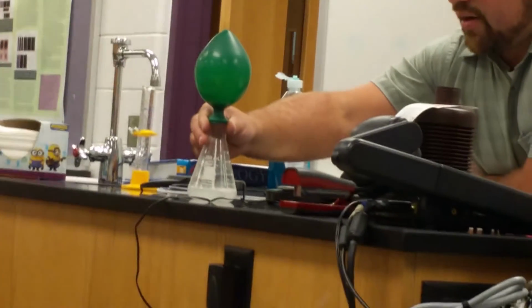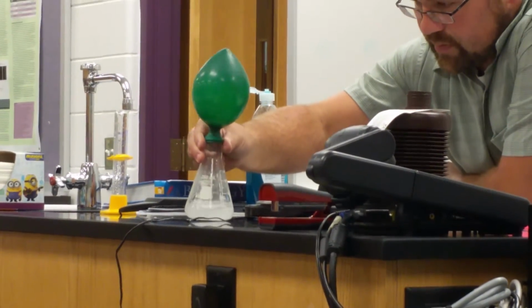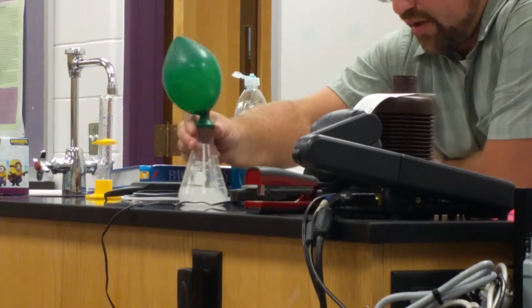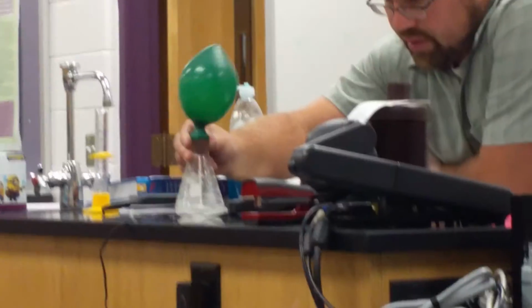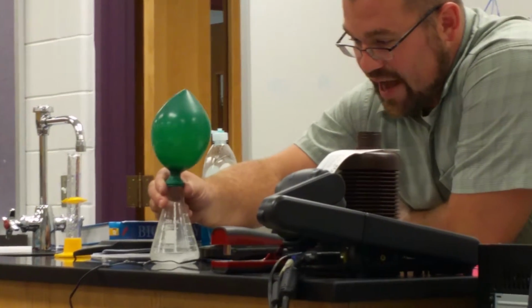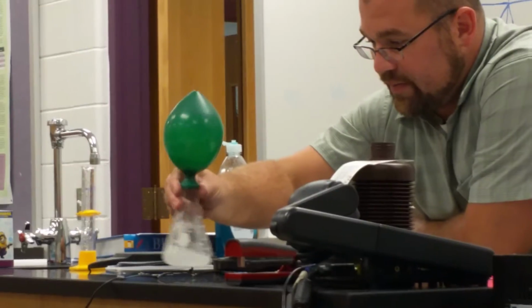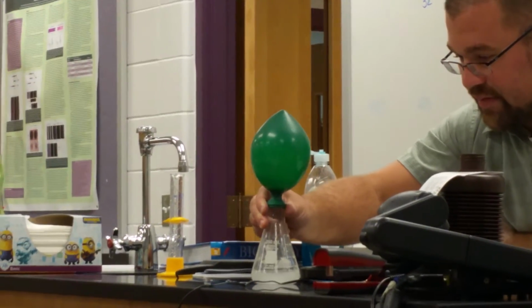And so we're going to go ahead and let all of this dissolve, just like we did before. But hopefully, if we can measure this quantitatively, we can show that it was the gas that escaped that caused the difference in our first one. I'm just hoping the balloon doesn't fly out. Almost done. There we are.